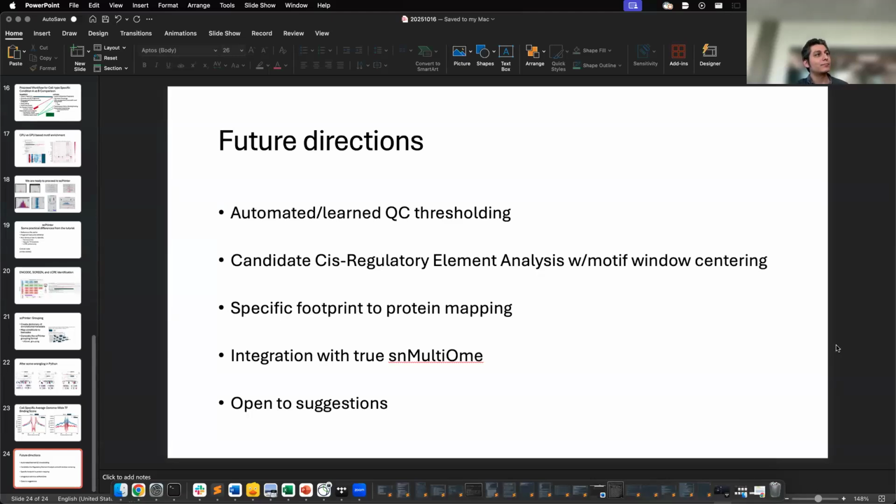I also kind of missed where Muon comes in, because you mentioned the AnnData object. Is that specific to SnapATAC2, or is that where Muon is coming in? My understanding is that Muon takes advantage of the AnnData and the AnnDataset data structures, as does scPrinter, as does SnapATAC. So I'm assuming they will play nicely with each other. It will be somewhat easy to move data from one modality into another.